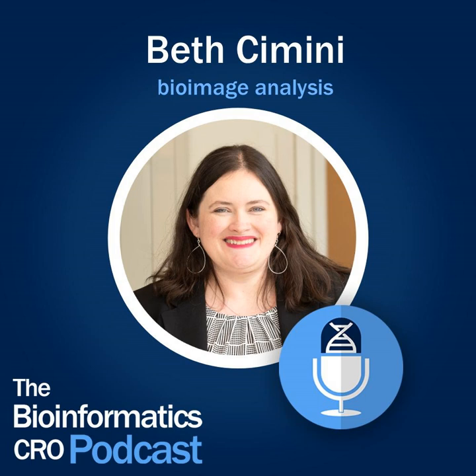Because we're at the Broad and the Broad's mission is to do things at scale, we tend to work with people who are doing early stage drug discovery, high content screens, but that's a function of where we are. Bioimage analysis definitely happens everywhere.